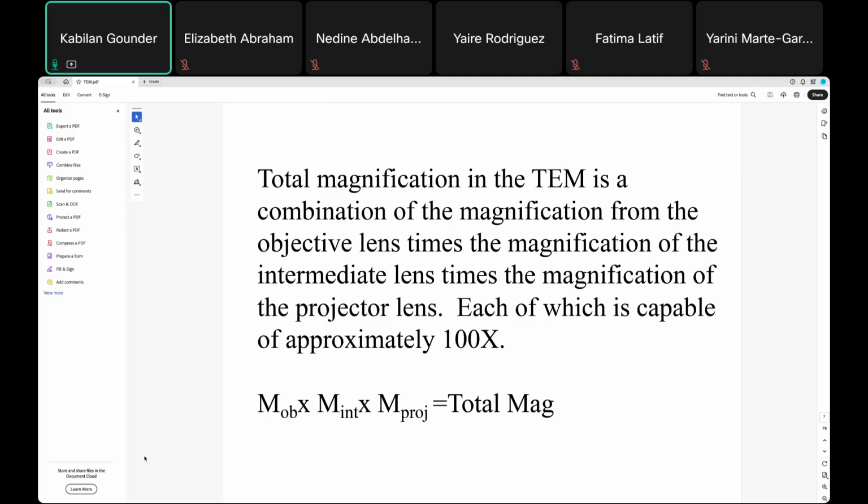So when you compare this organelle, which is for example healthy, with other infections or cancer cells, the same 300,000 times magnification may give you a very small area of image compared to the healthy one.